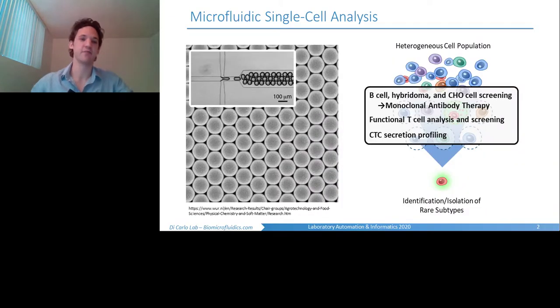So I originally came from a microfluidics background. And in this field, we've seen over the last really 2 decades or so that it has been a very powerful tool, and that specifically it enables the creation of highly uniform compartments at the length scale of single biological entities. So this includes things such as proteins, DNA, as well as single cells, which I'll be talking about mostly in this talk.